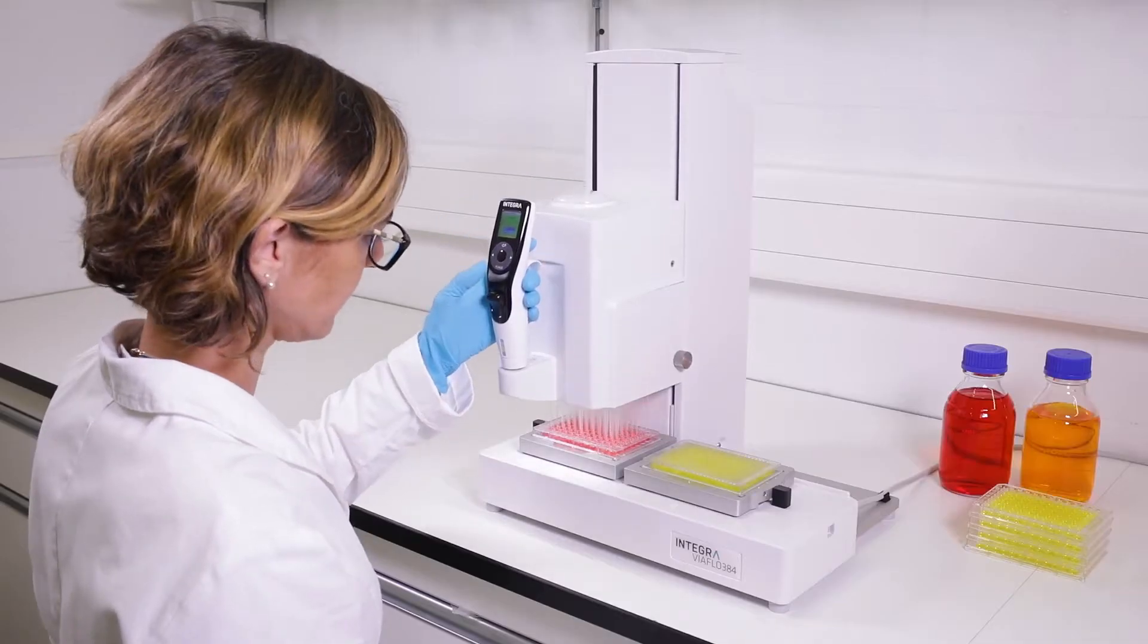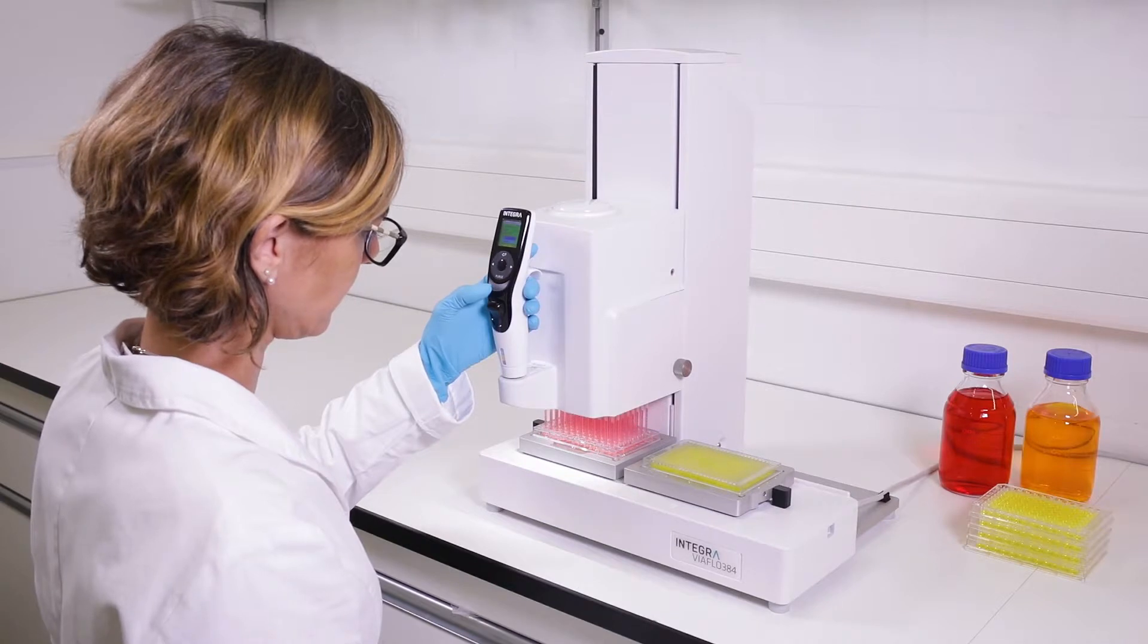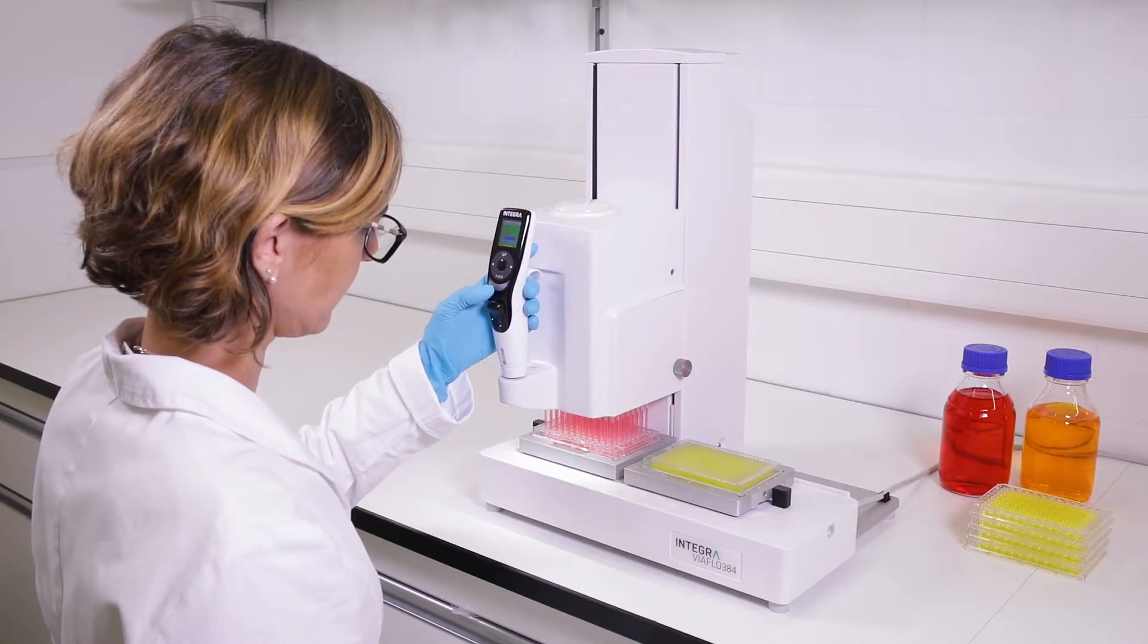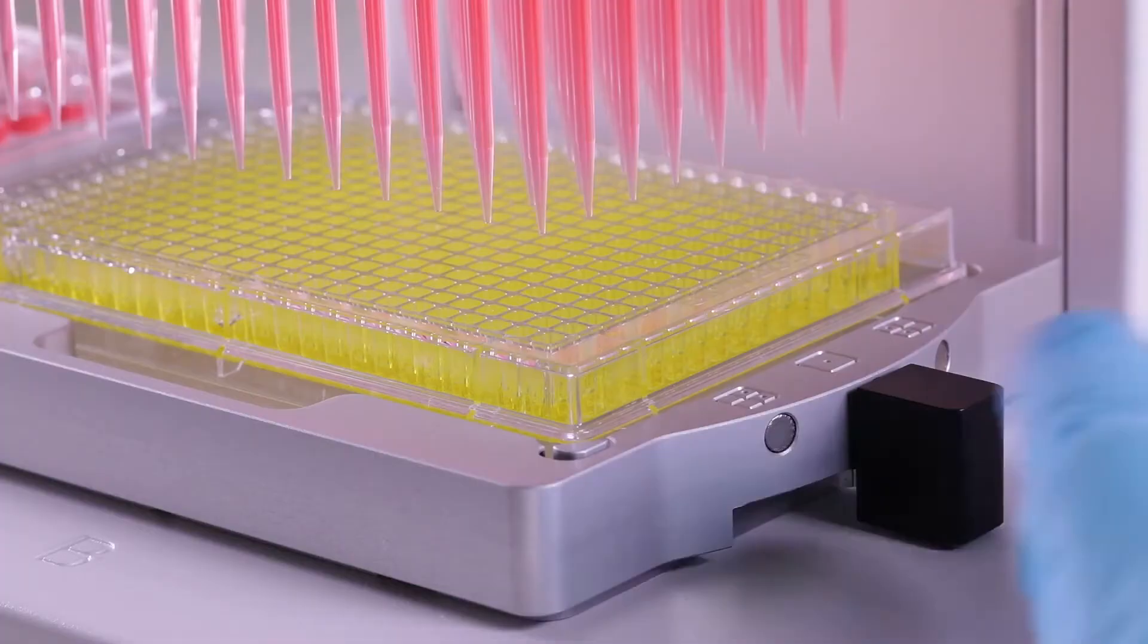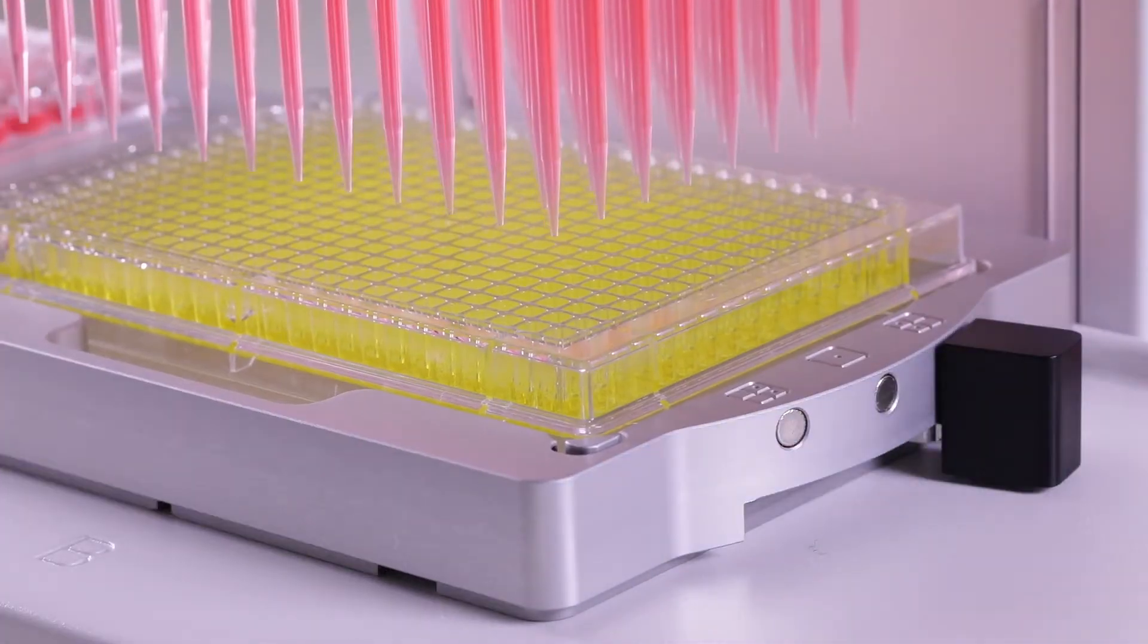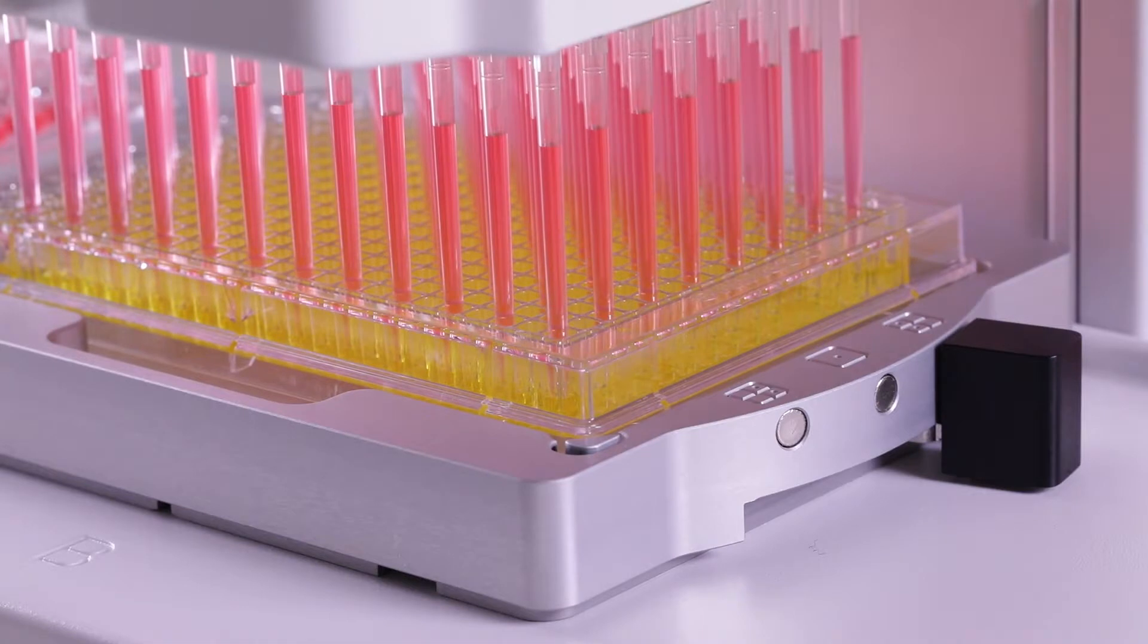Reformatting a 96-well plate into a 384-well plate is incredibly easy, using a 96-channel head. Simply move the lever to the back in order to access the wells in the front of the plate.